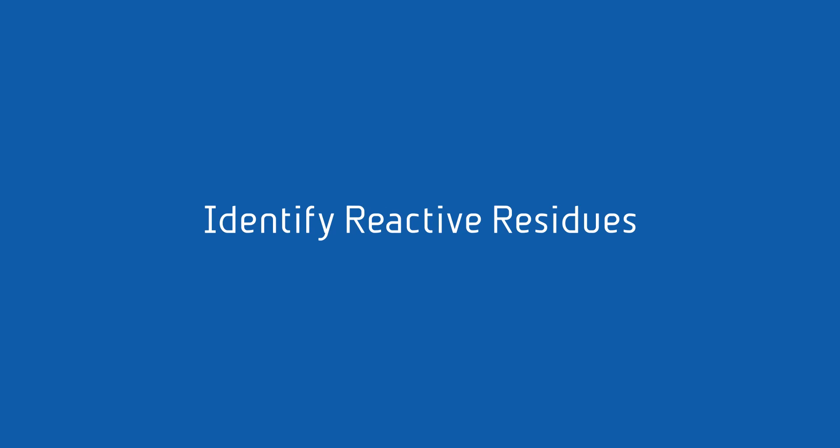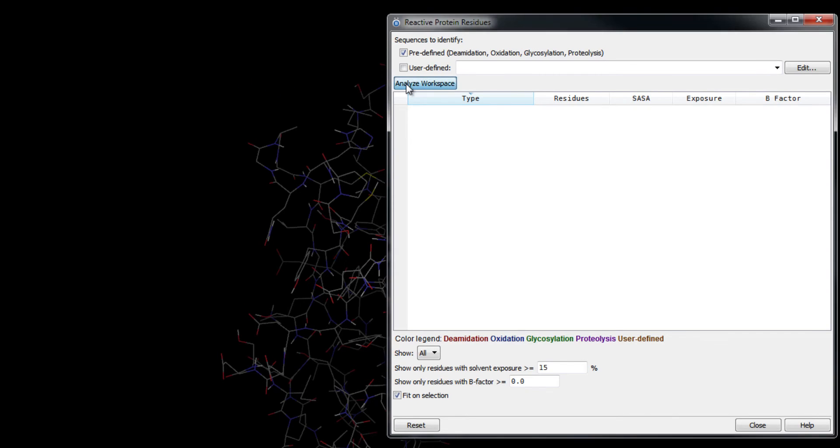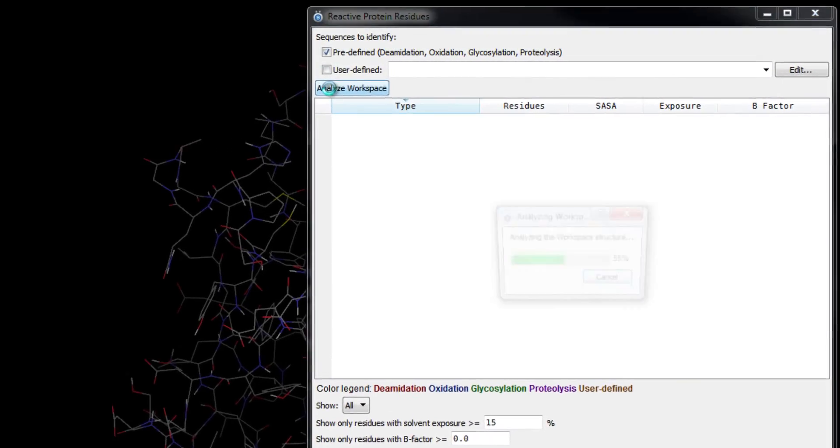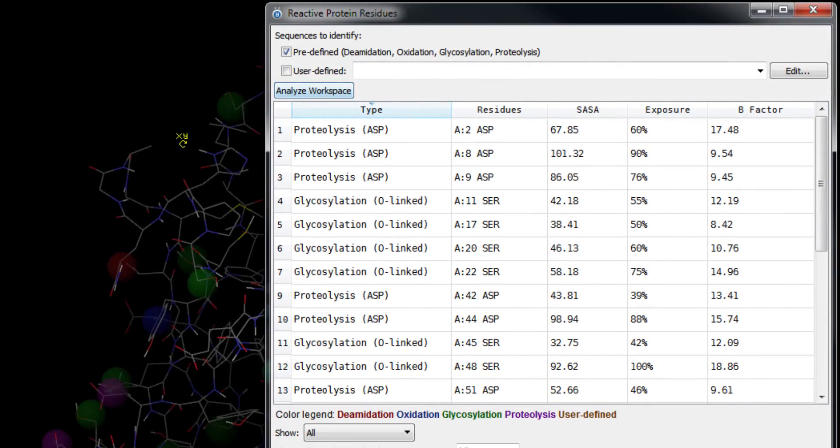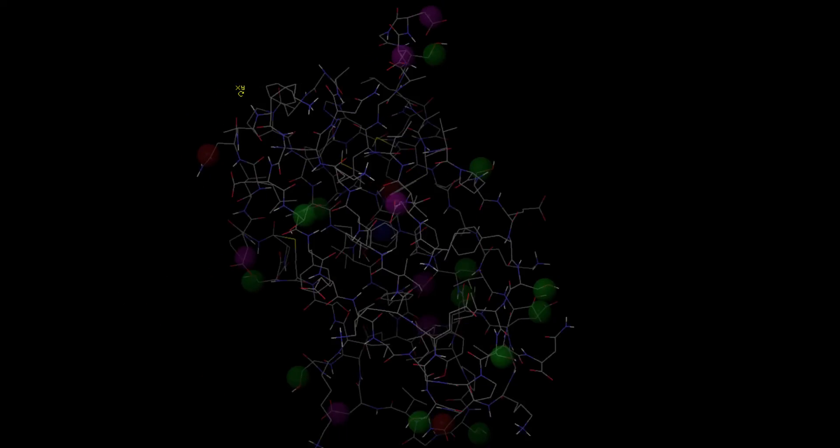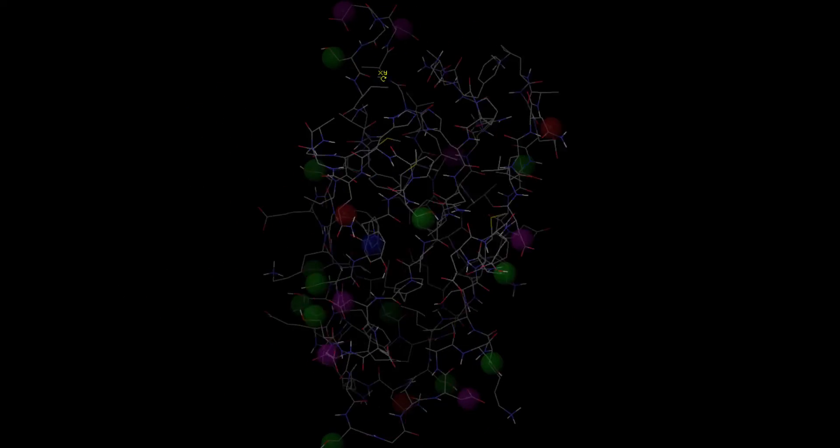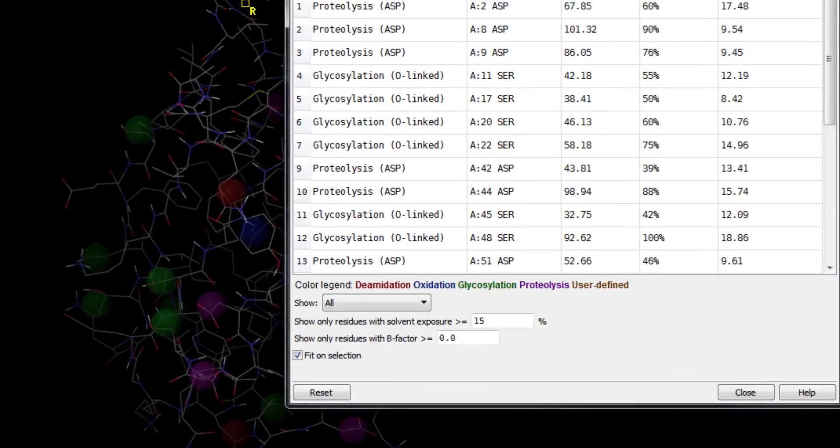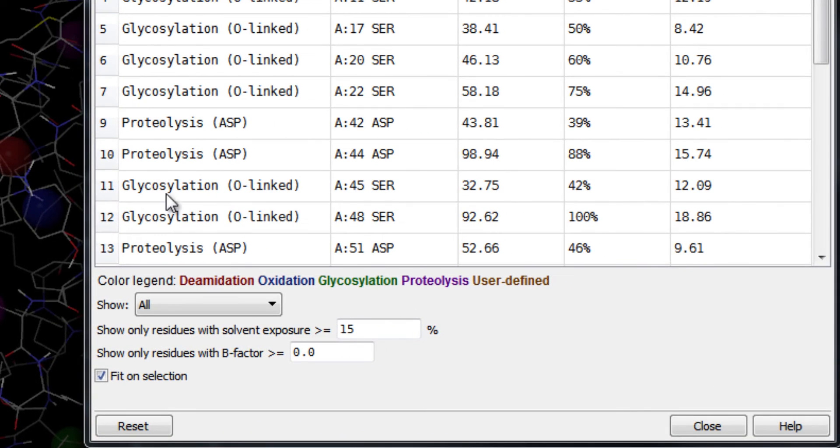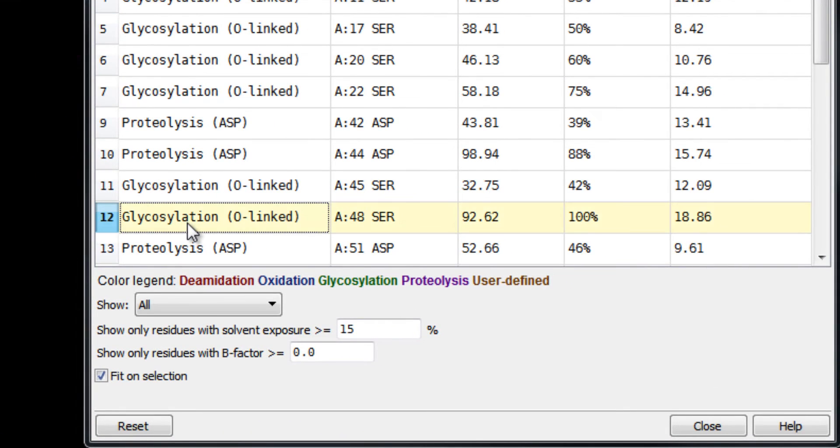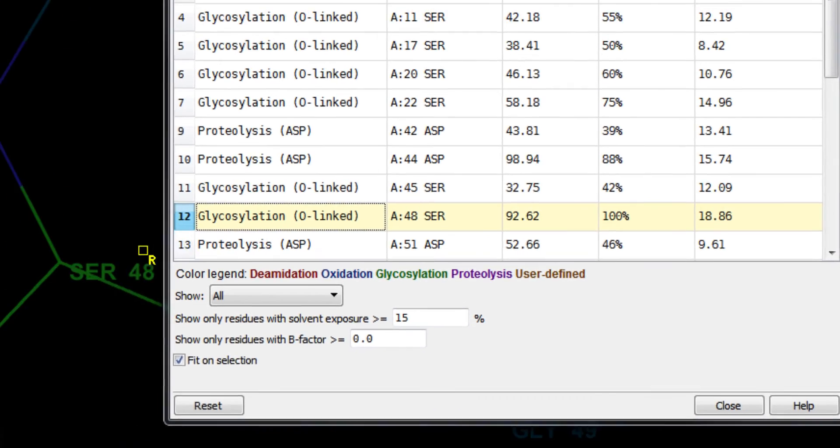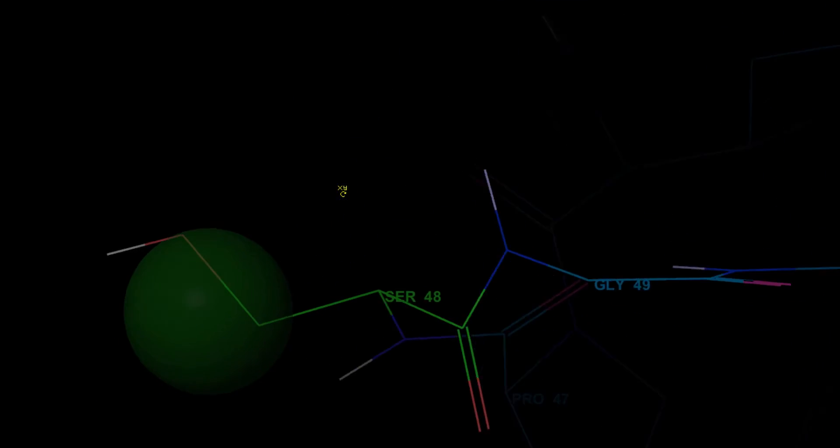Identify reactive residues in a protein that may require mutation. Reactions include deamidation, oxidation, glycosylation, and proteolysis, and visualize the reactive residues in the workspace.